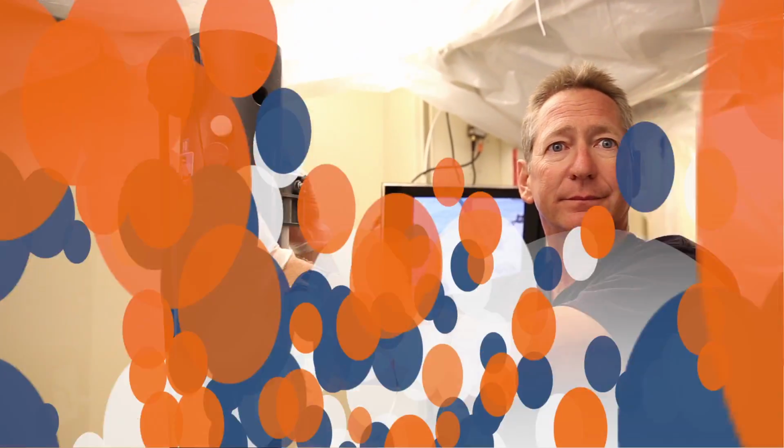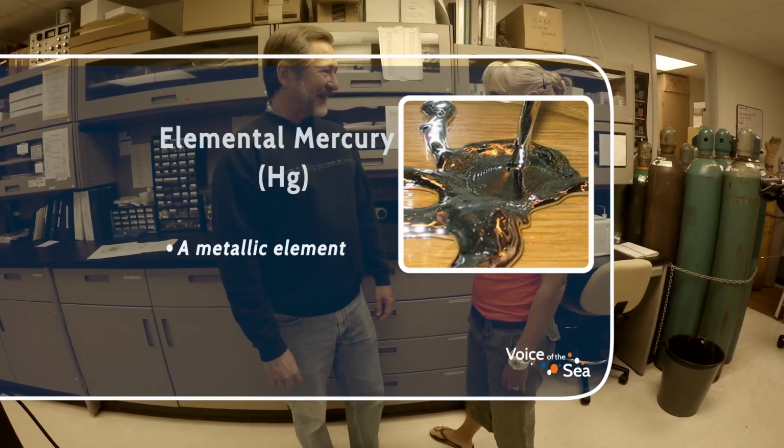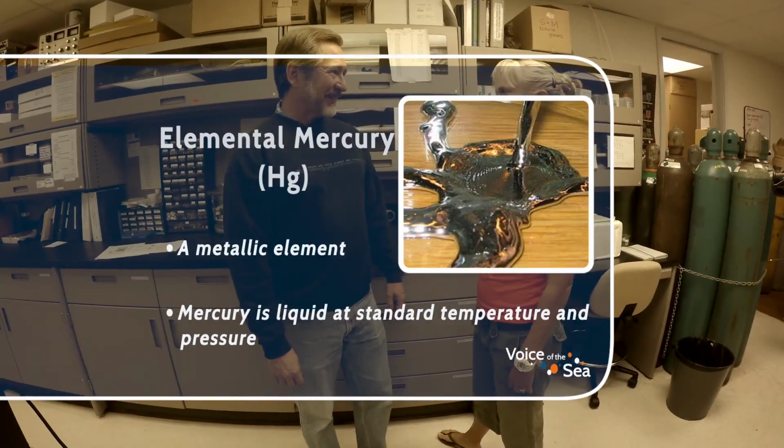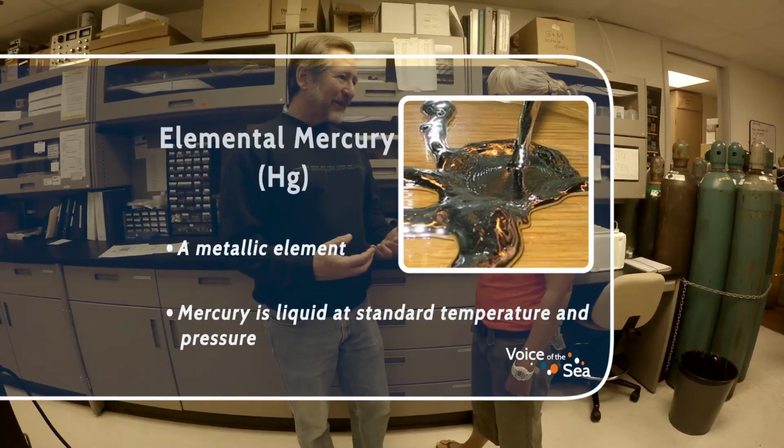When we bring our samples back here too, we want to be really, really careful about any contamination from the environment. We have special clean labs that we use only for our mercury analyses. We don't have to worry about that for nitrogen and carbon. There's no contamination that we have that's a problem. But if mercury gets in, either from the dust on the floor or from fluorescent lights, there's a lot of mercury in fluorescent lights, that's a problem. So we have to use a special clean lab to do that.